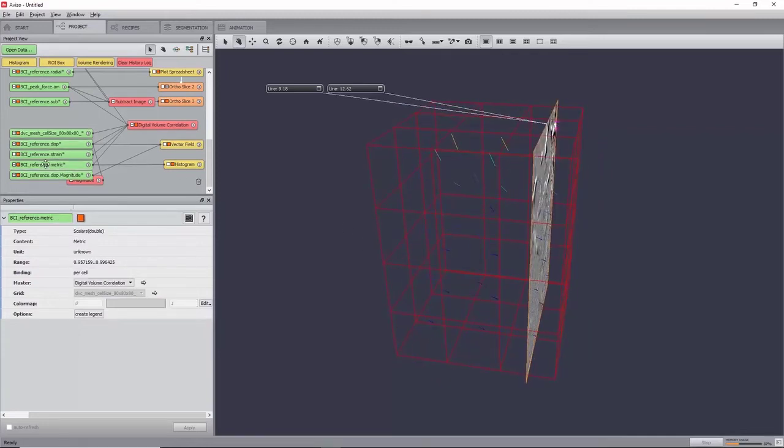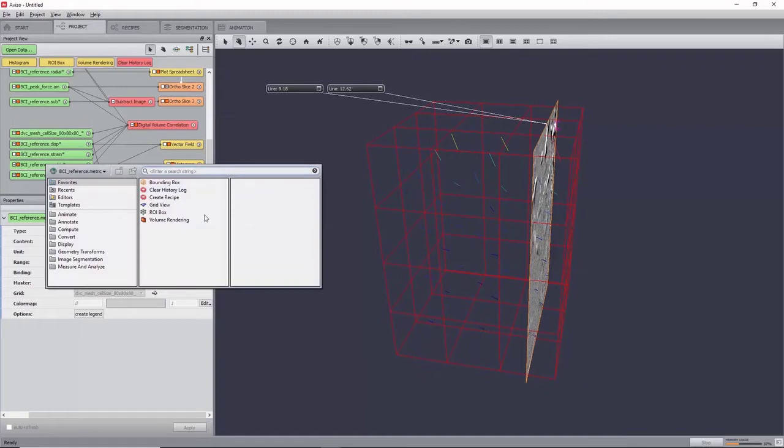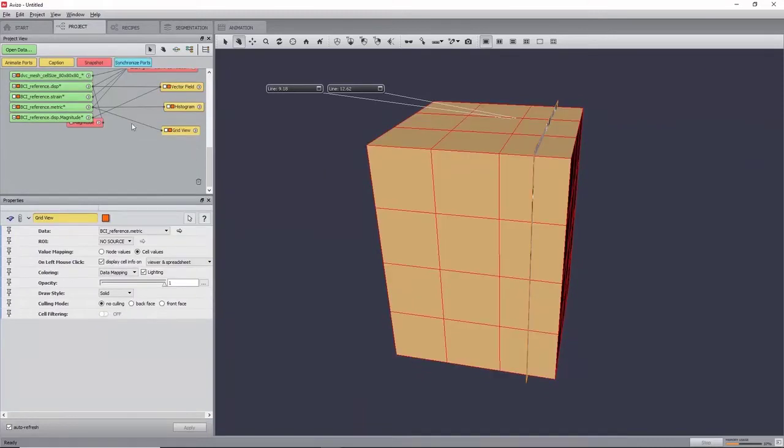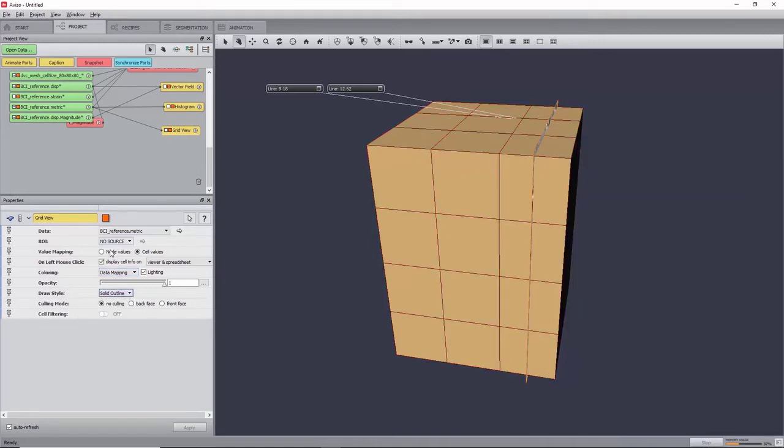You can now visualize the 3D render of the metric value with a grid view, setting coloring to data mapping, opacity to 0.5, and value mapping to cell values.